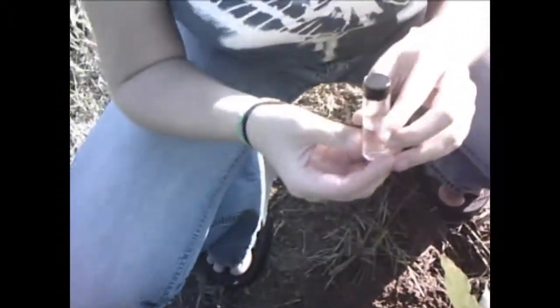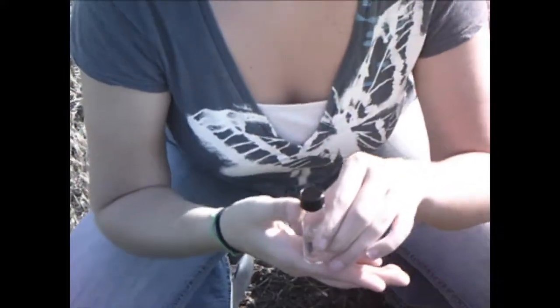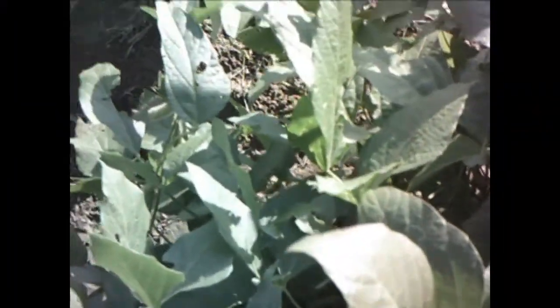Say hi to the camera, Jess. Hello. Alright, let's start the tutorial. Thank you for joining me today. I'm going to be explaining to you how to use just a little vial and a little bit of alcohol to collect small soft-bodied insects from plants just like this.